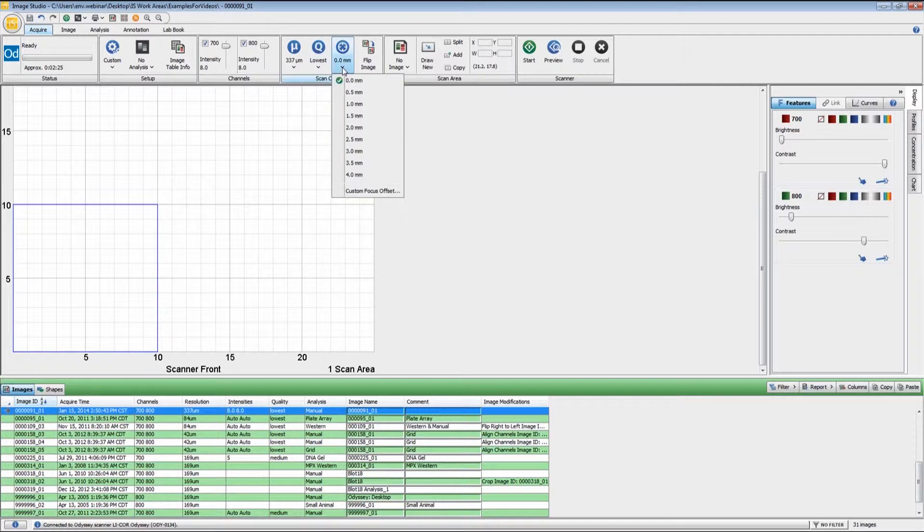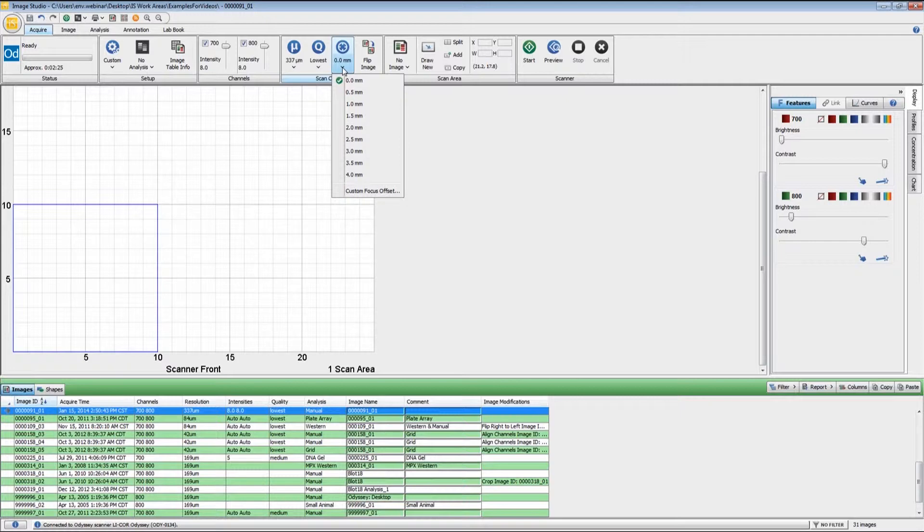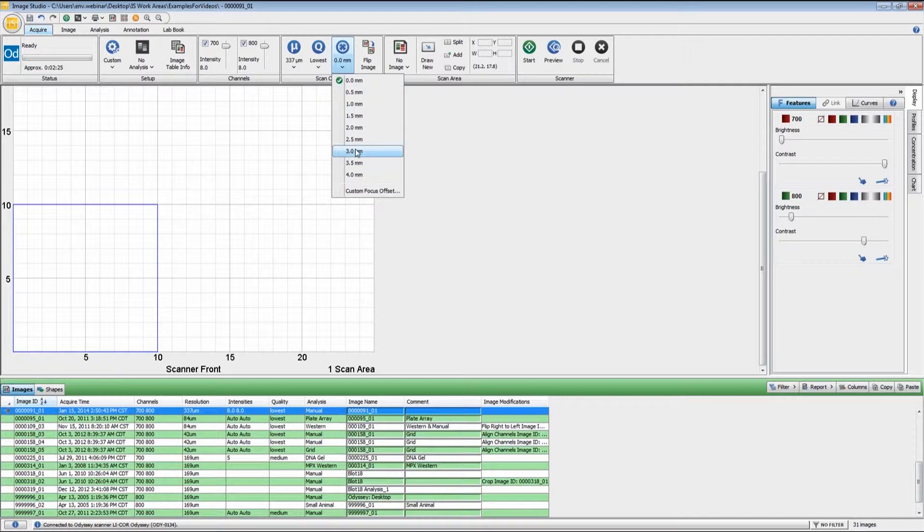The focus offset allows you to change the focal point of the optics. For membrane-based assays, we do recommend zero because that's right at the plane of the glass. For gels, it will be half the thickness of the gel. If you have a 1mm Coomassie stain gel, you would set that to 0.5. For plate-based assays, generally a 96-well plate has an approximately 3mm offset. That is the distance from the scan bed to the bottom of the wells. Other types of plates may have slightly different focal offsets, and that may be something that you have to determine empirically.